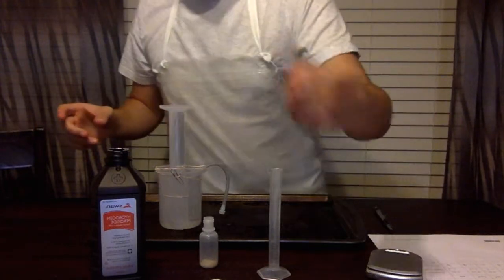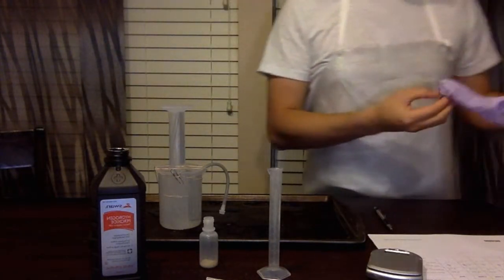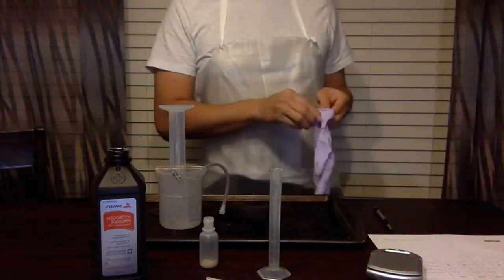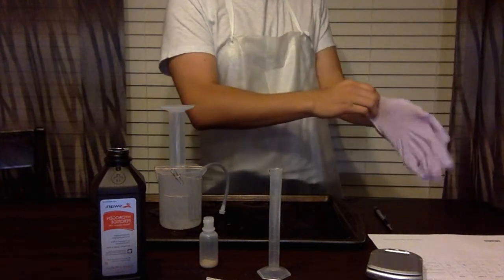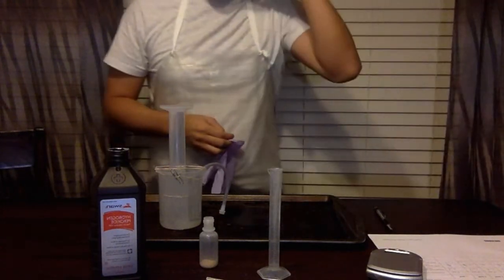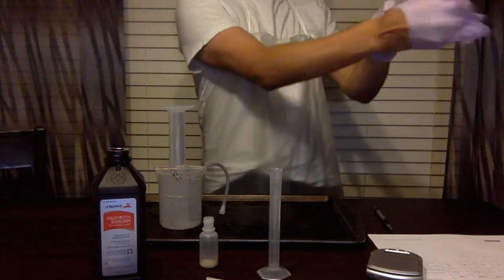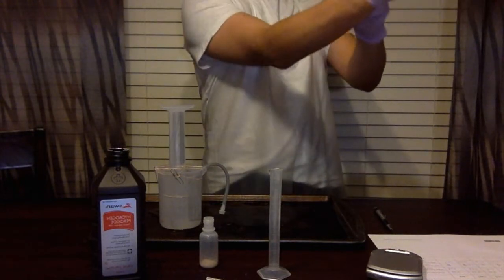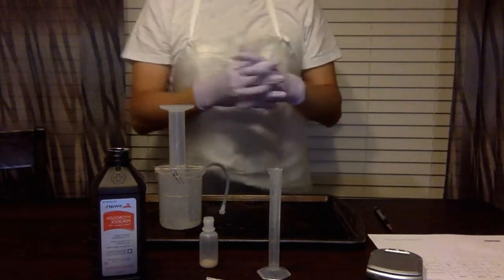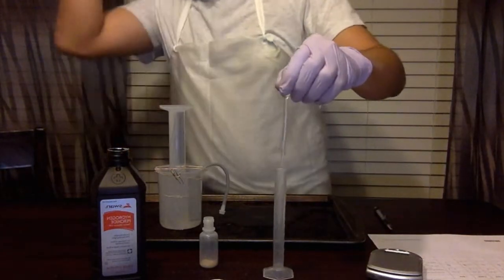And you know what? I don't want to bleach any of my clothes, which is the reason why I'm using my apron. I don't want to get any hydrogen peroxide in my eyes, which is why I'm wearing the goggles. I'm sorry, and we're also going to need protective gloves for our hands. So let's go ahead and measure out 1 milliliter.